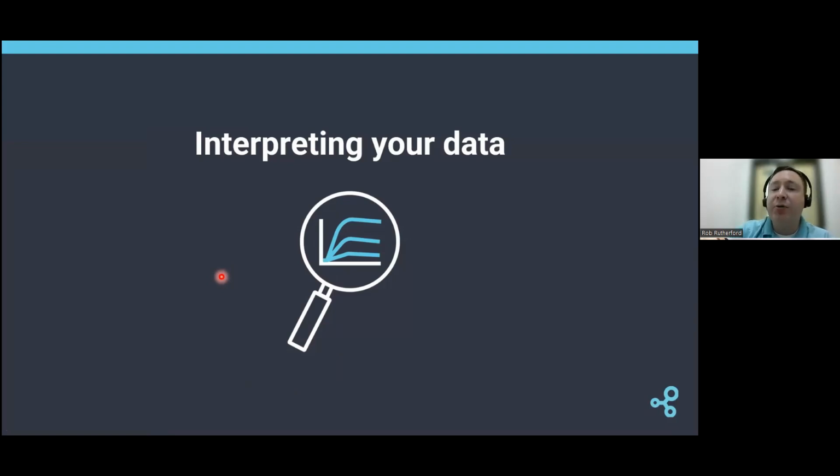If you're planning to reuse that same sensor, maybe you have a regeneration that will allow you to test a different type of analyte, then you can start a new test using that same sensor. One thing that we recommend doing is, if you're going to reuse a sensor, try to keep it docked in the instrument. Do not undock it, put it in the fridge, 2 days later, come back, try and dock it again, prime the instrument and use it. If you're going to be reusing a sensor, it's preferred to keep it docked and to leave the system in standby using the running buffer that would keep that ligand happy.